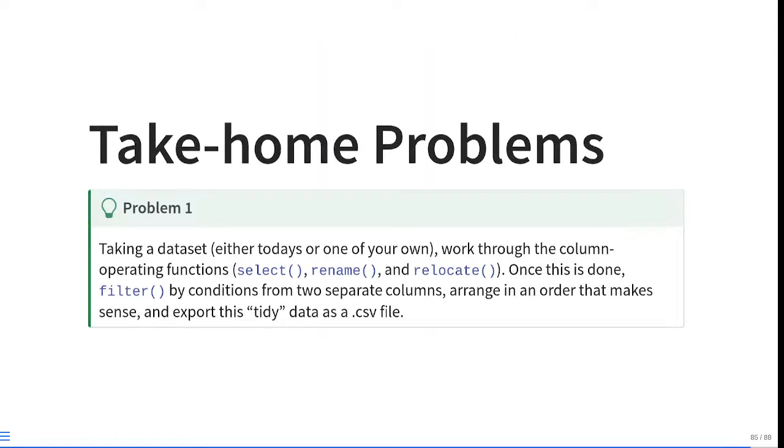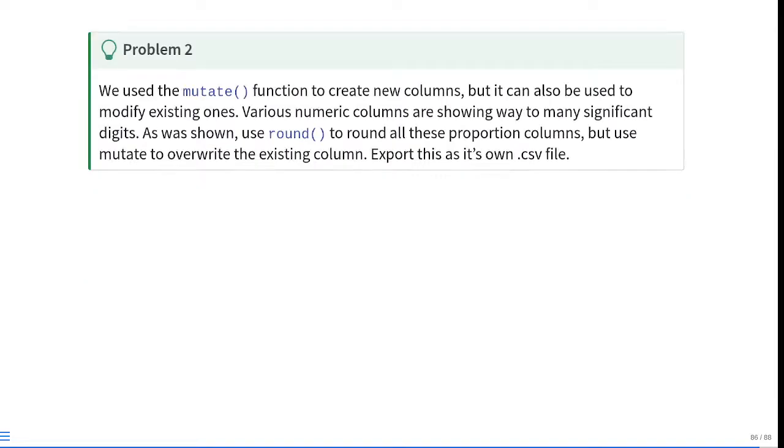The take-home problems this week are very much focused on wanting everyone to play around with their own dataset or the dataset that we provided, just to get familiarity with how to use these different functions, because these are functions that we will be using basically every single day throughout the rest of the course. The sooner you get some familiarity with them and apply them to your own data sets, the better off you'll be in the long run. So the very first question is basically to play around with the data, rearrange it however you see fit, and save it as a CSV file.